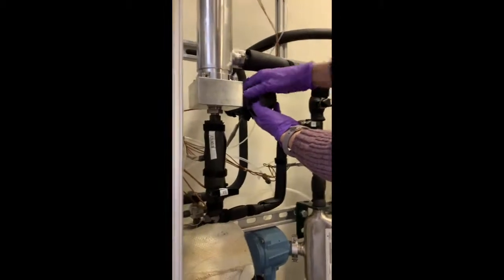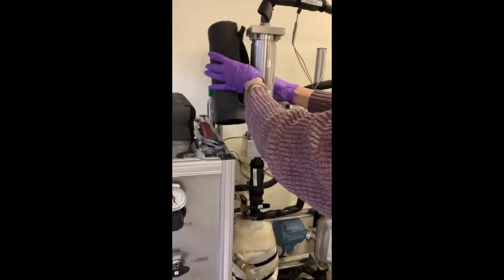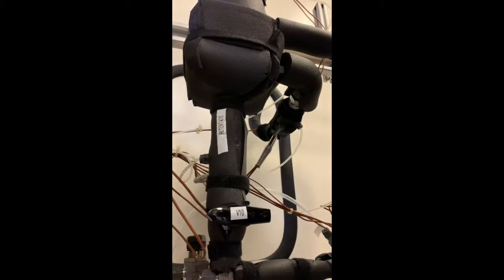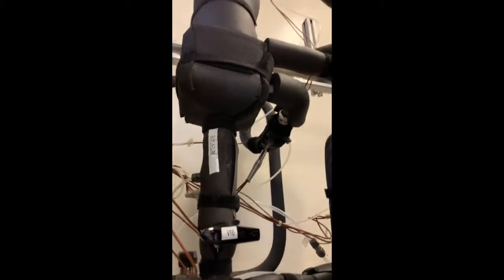The system is monitored by pressure and temperature gauges at each of the module ports. The whole system is then insulated to mitigate heat loss as temperature directly affects the separation rate.